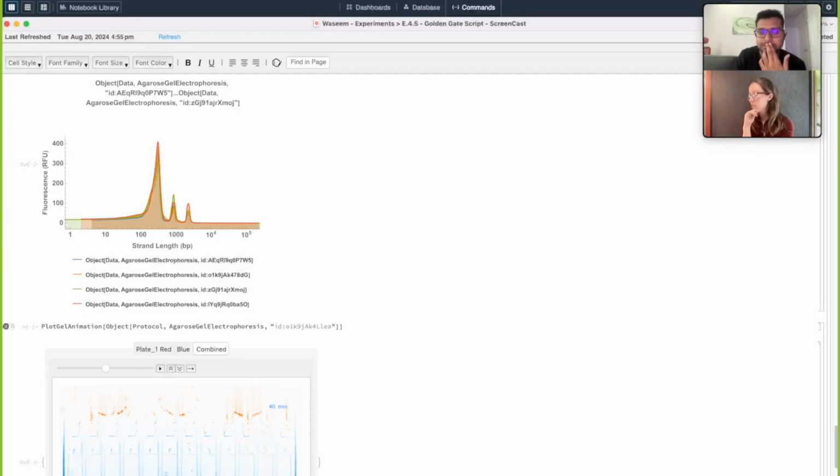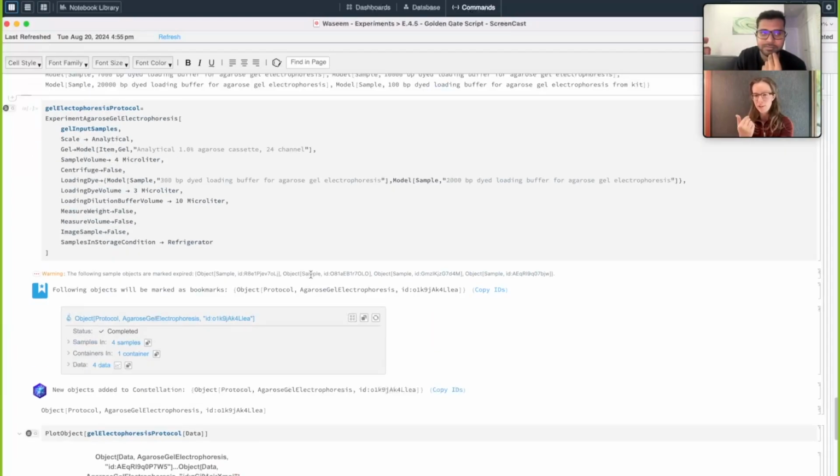And this gel electrophoresis, doesn't it have the ability to do gel extractions also? Because you can basically fractionate. Yes, it's fractionating, so you can take a fraction based on whichever one you desire. Right. So for gel extraction, instead of analytical, you'll have to perform a preparative gel in order to do gel extraction.